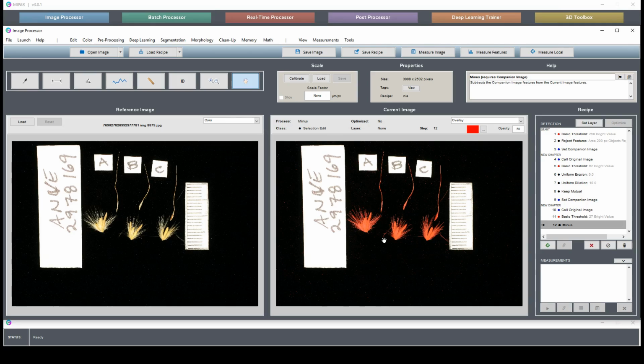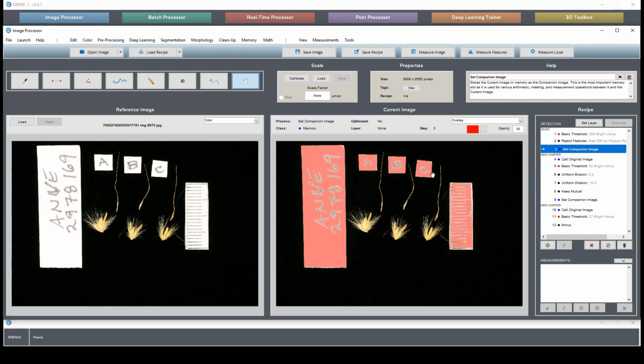And when you're doing this, you can use all sorts of criteria for this distinguishing characteristic. Perhaps you've got some sort of function that finds text, right? Or perhaps your labels have a lot of lines in them, or perhaps your labels or whatever it is that you're trying to find is very smooth compared to your other sample or your features that you want.